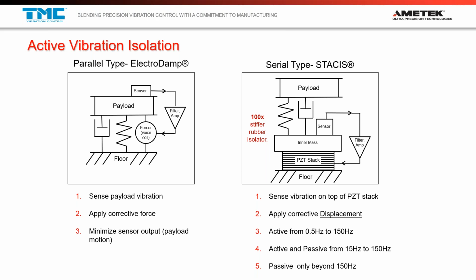And we're using the reverse piezoelectric effect, which means we're applying a voltage to the stack. And because we're applying that voltage, the ceramic crystals inside are going to expand and contract. And we're talking about orders of microns here. So 6 to 12 microns is actually kind of high displacement for what we've seen here, but that's the level of sensitivity we're dealing with.